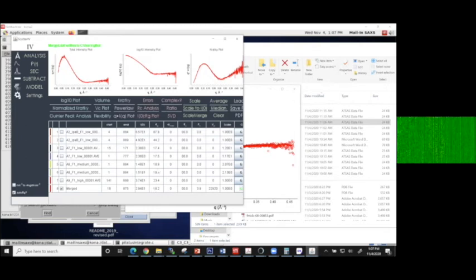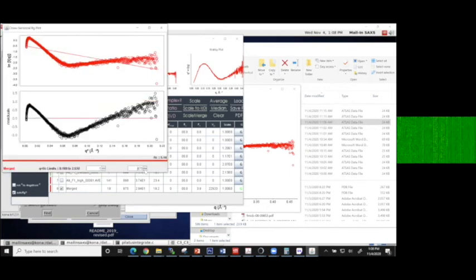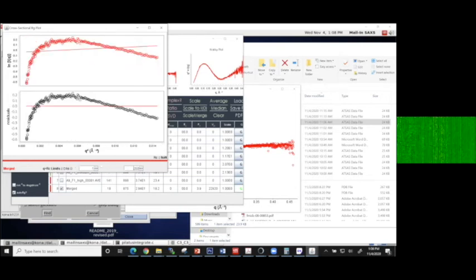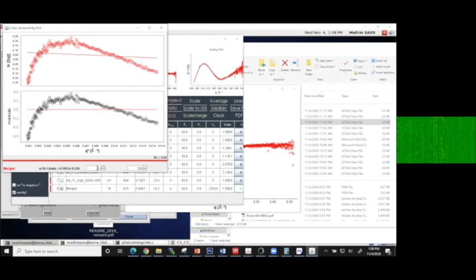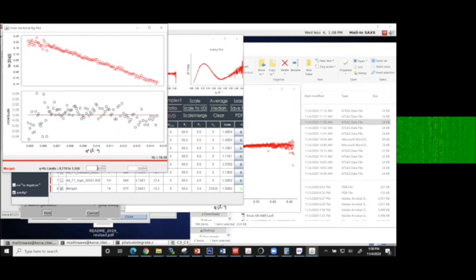There is a way to also, so the radius of gyration is the first moment of inertia kind of measurement. There's another, the second moment of inertia, that's called the radius of cross-section analysis. You can hit the button, and it's very similar to the other tools where you find the linear region here. So sorry, you're going to go 200. You find a linear region in here, sloping up. And again, a lot of this is already in the video tutorial I have online on the YouTube channel.